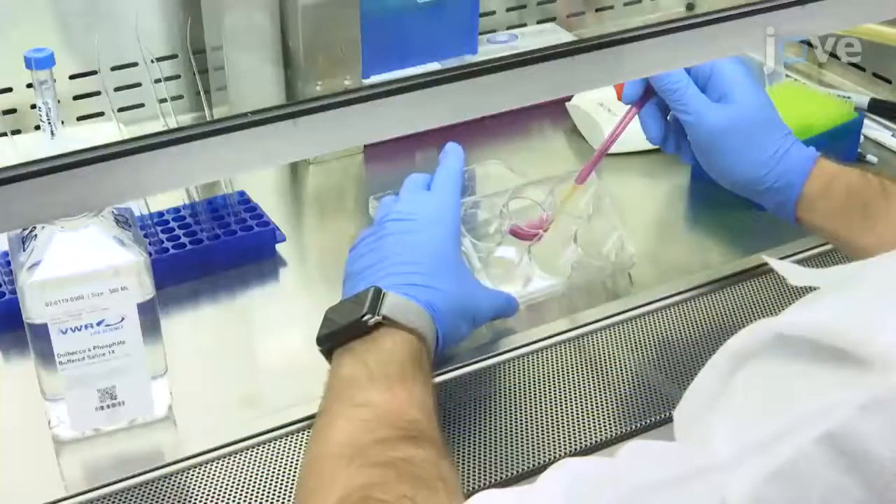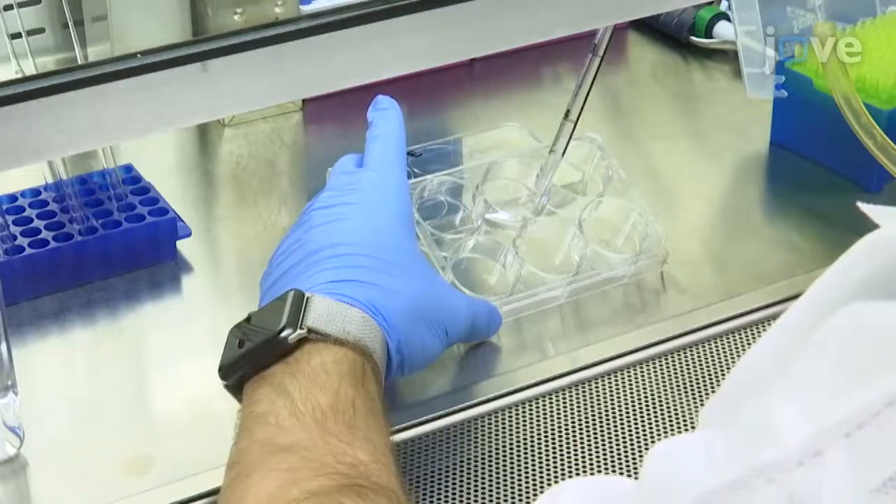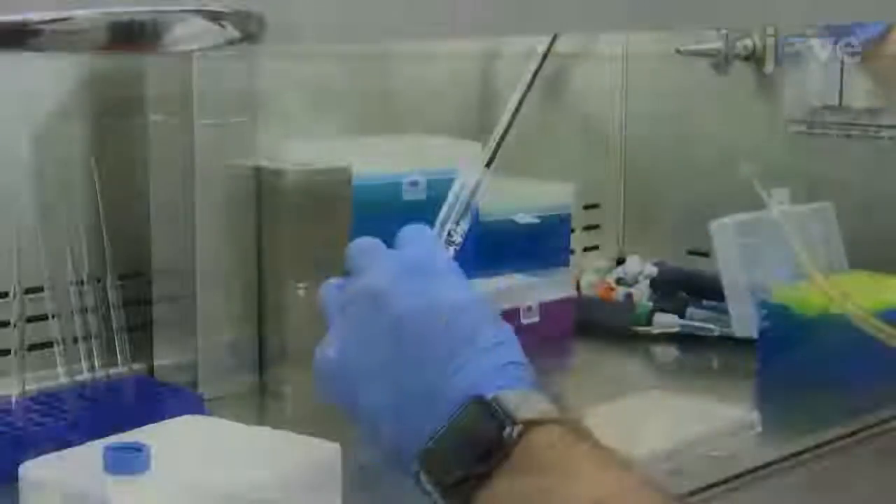When the pipettes are ready, wash each well of the differentiation culture with PBS, and add 1 mL of 0.05% trypsin.